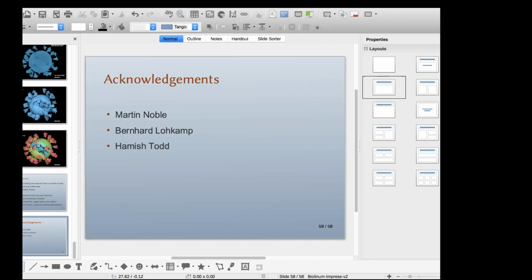The back end will need to change from OpenGL to Vulkan, but 90%, probably more, of what I'm needing to do to get OpenGL working is the changes needed for Vulkan too. It's colored vertices and triangles and buffers, vertex buffers. All of that is going to be the way Vulkan works as well.